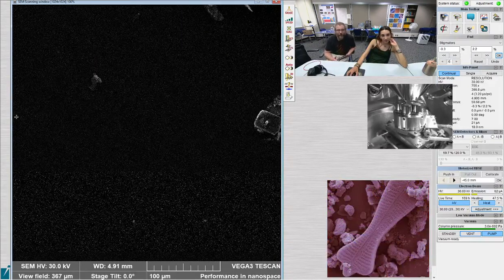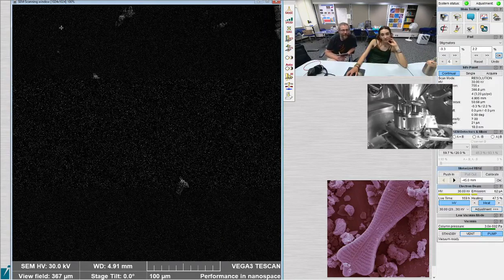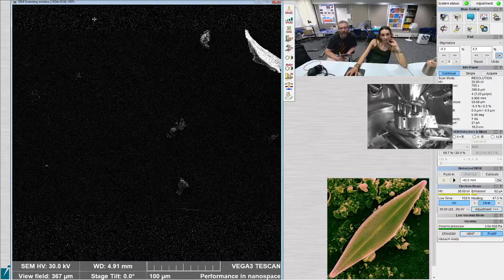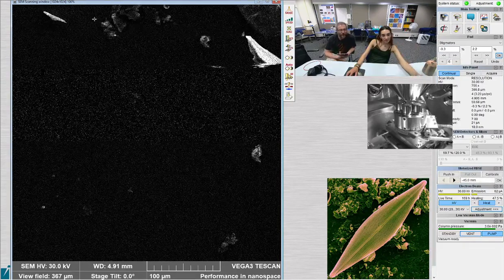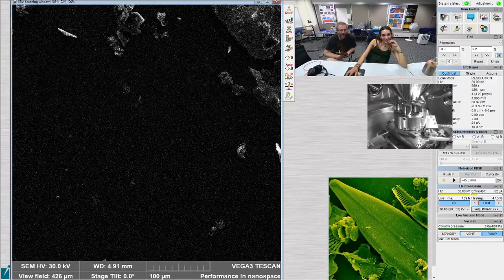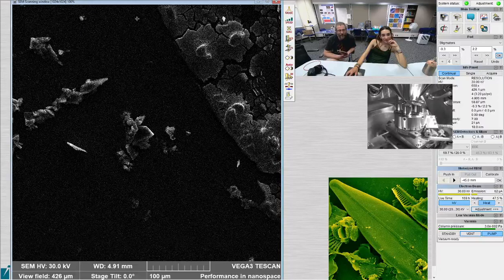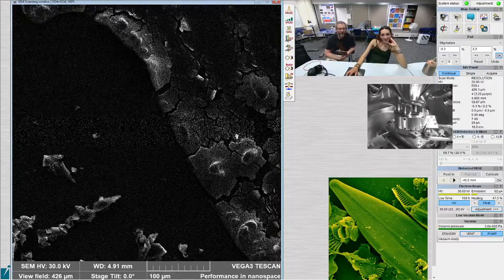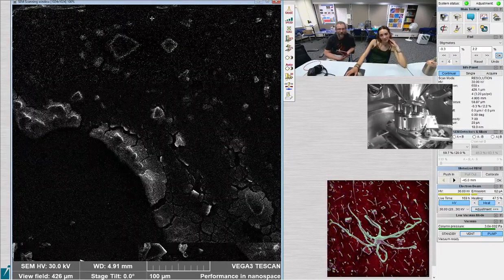Welcome into the channel. We are looking at some 6 million year old diatom fossils from a lake in Nebraska, but the lake is gone and all that's left is ash and diatoms. And so we're ignoring all of the ash particles and we're looking for the diatoms. And this is a graduate student working in my lab, Laura. Hi. And she's here getting experience using the scanning electron microscope. And eventually she's gonna be a wizard at it.